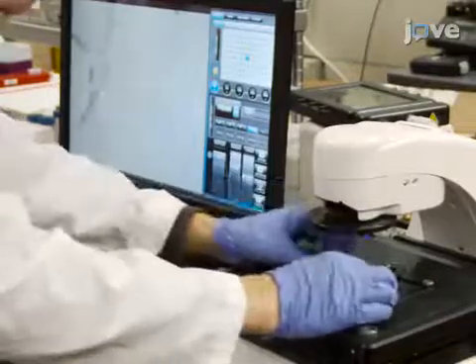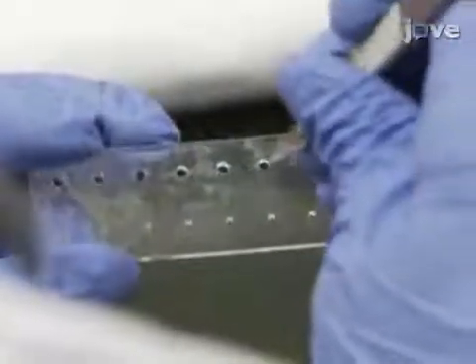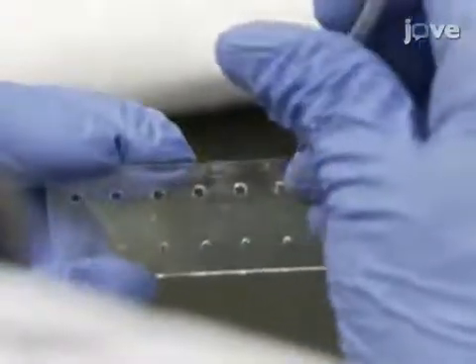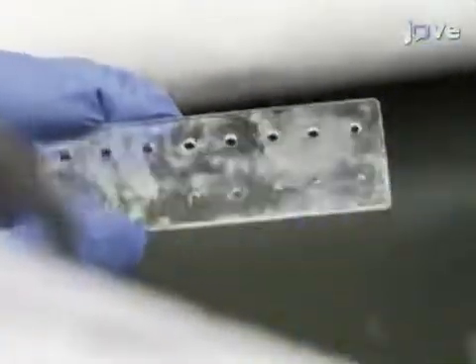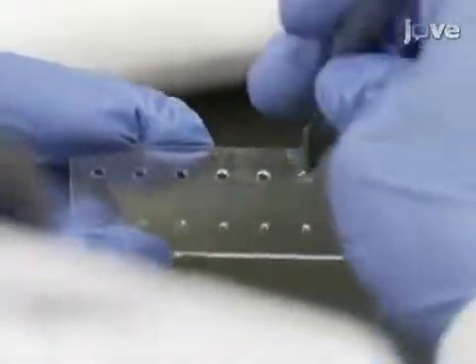If leftover material is found during visual inspection, use a razor blade or scalpel to carefully remove any material that prevents the device layers from lying flat against one another, so that the interfaces of the layers come into conformal contact.